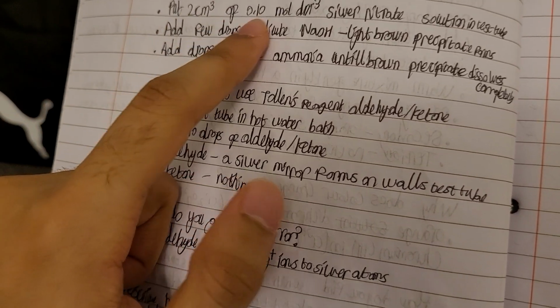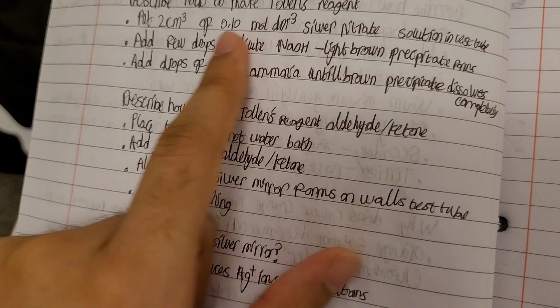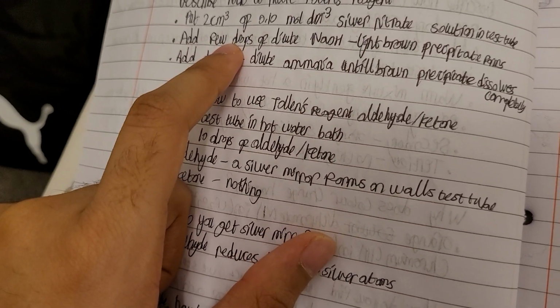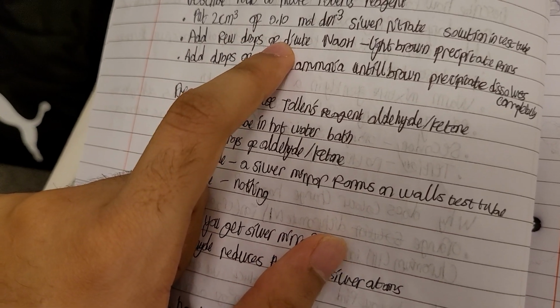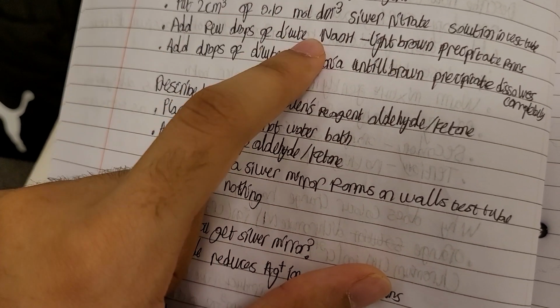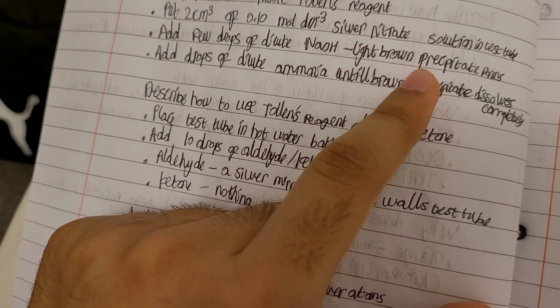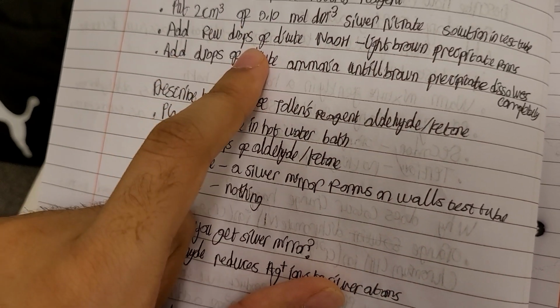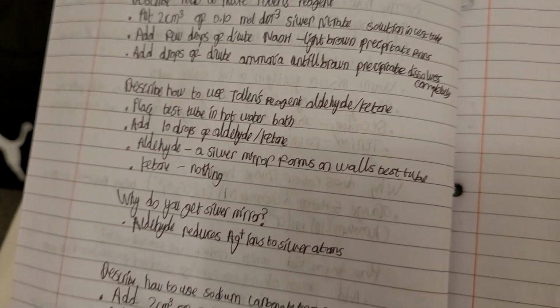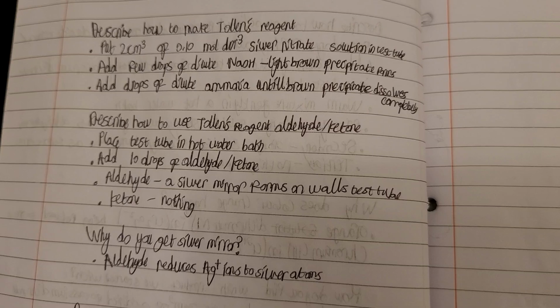To recap: put 2 centimeters cubed of 0.10 mol dm-3 silver nitrate solution in a test tube. Add a few drops of dilute NaOH, sodium hydroxide. A light brown precipitate should form. Then add drops of dilute ammonia until the brown precipitate dissolves completely.